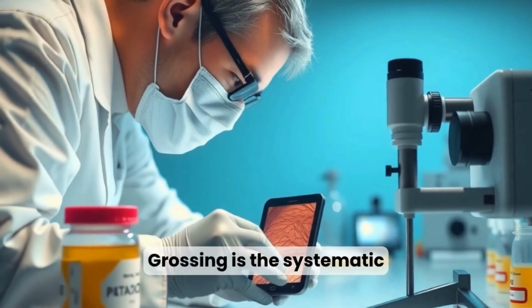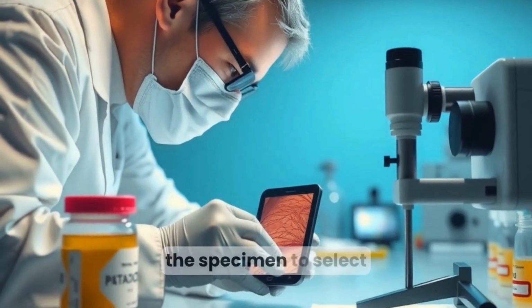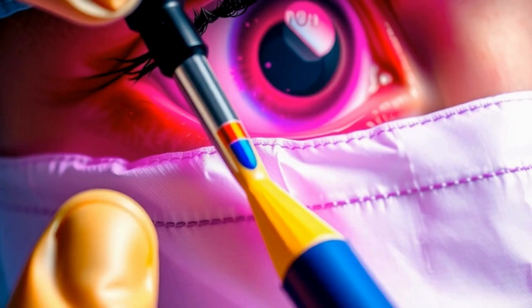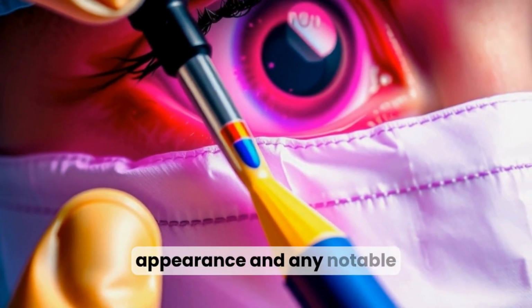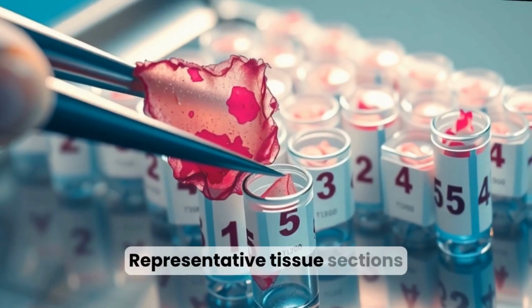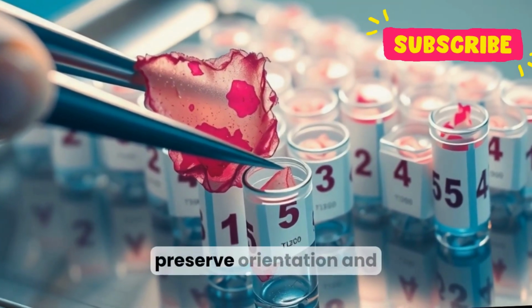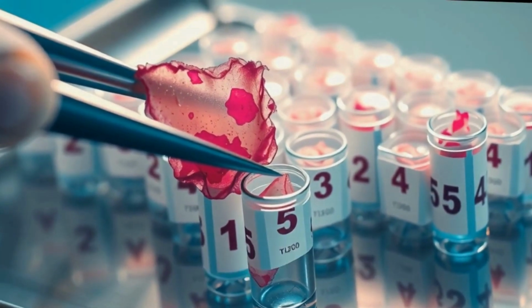Grossing is the systematic macroscopic examination, measurement, and dissection of the specimen to select representative areas for histology. The pathologist or trained technician documents size, appearance, and any notable features, then inks margins when relevant for orientation. Representative tissue sections are sampled, placed in cassettes, and labeled to preserve orientation and diagnostic context for the slide.